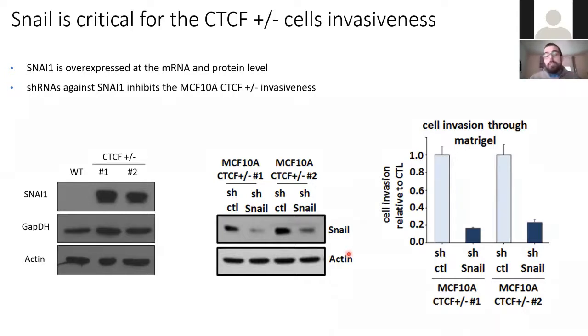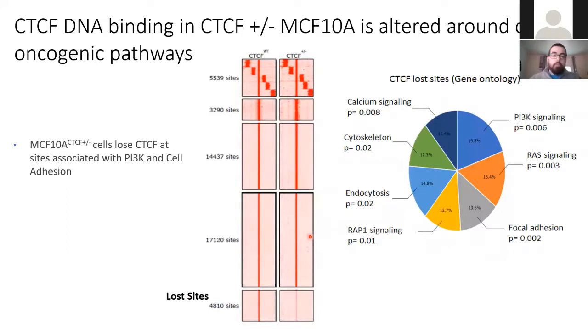And the next step in our model was to do a ChIP-seq on CTCF to look at the altered sites of binding of CTCF around genes that were either up or down regulated.